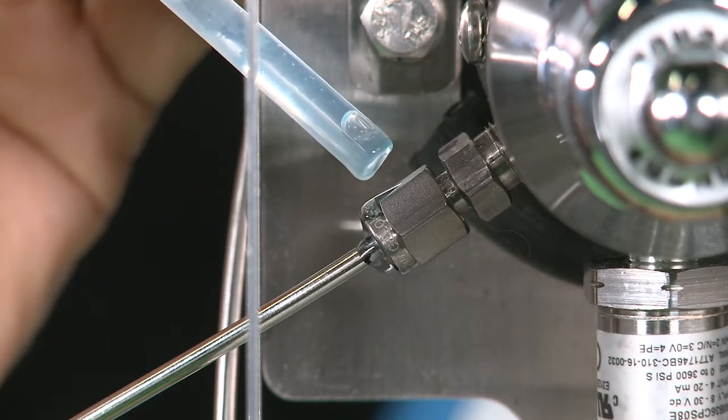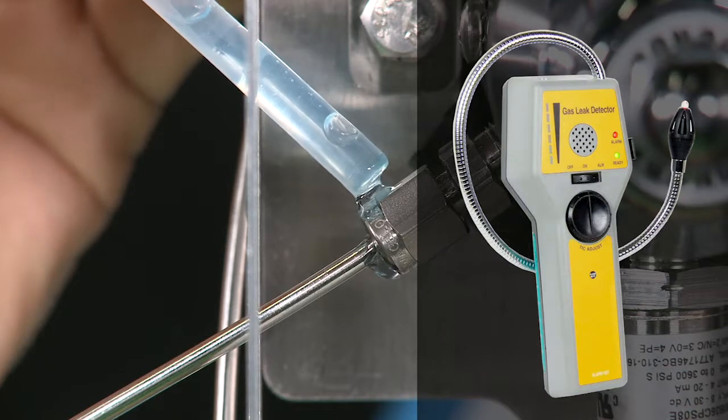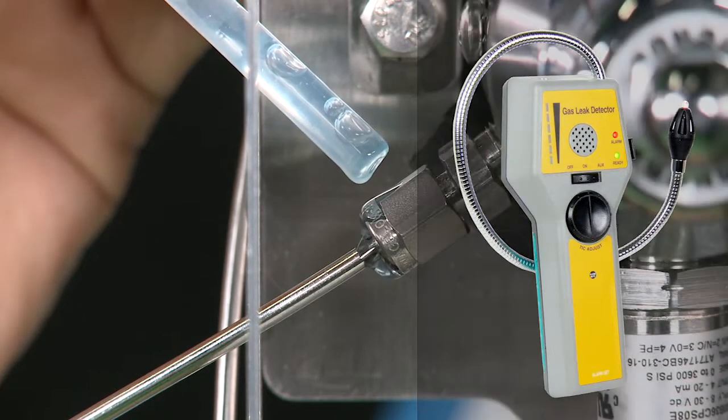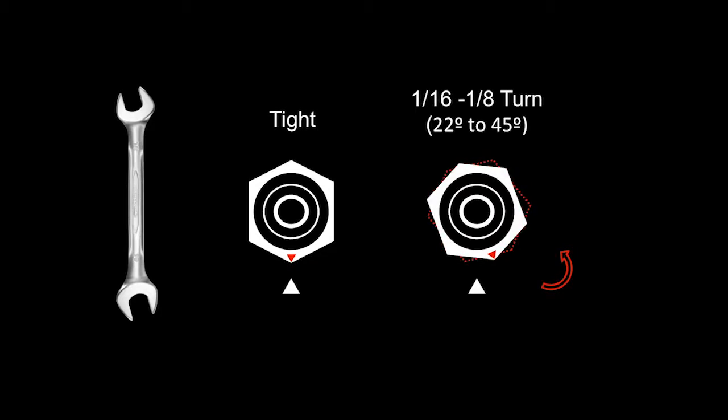Alternatively, a portable helium leak detector may be used to sniff for leaks around the fittings on a wind-still day. If a leak is detected, tighten the leaking fitting by 1/16th to 1/8th of a turn, 22 degrees to 45 degrees.